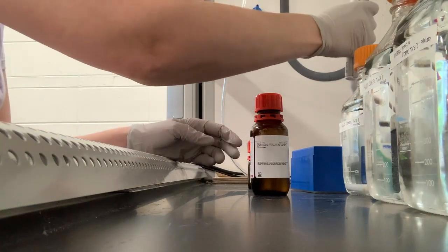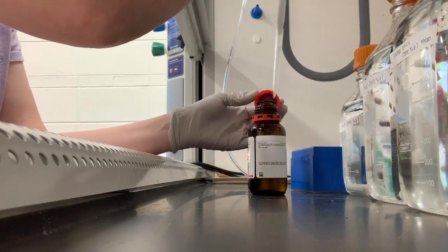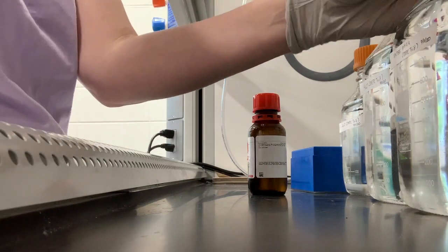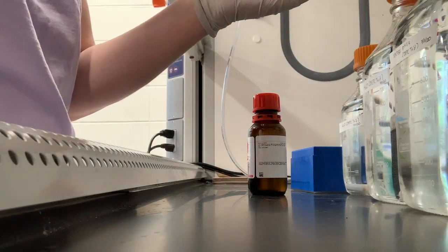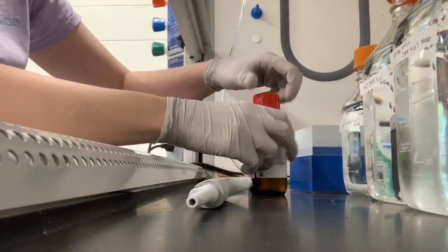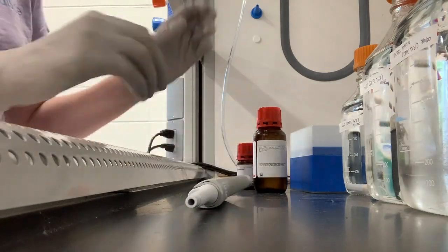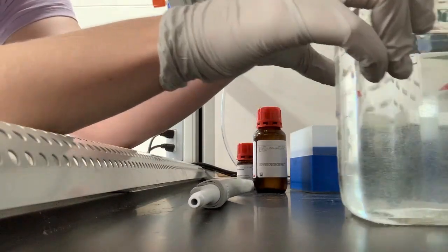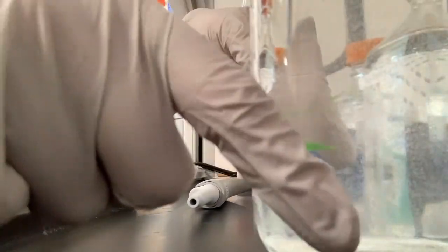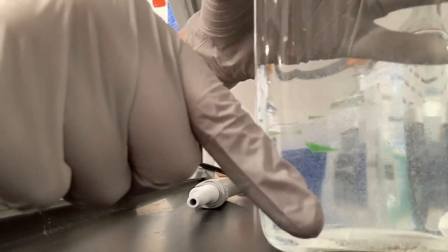We keep a bag in the back where you can put your spent pipette tips that have a less safe chemical on them. And one thing you'll notice when you add these chemicals, so I'm going to cap these, is that this Dep C is immiscible in water. So you might see these little blobs of the liquid not mixing with the water, but sort of floating around, kind of like oil and vinegar.